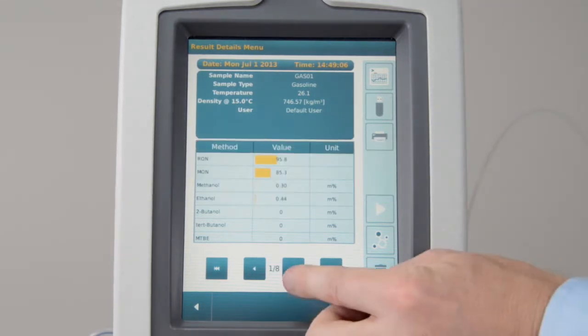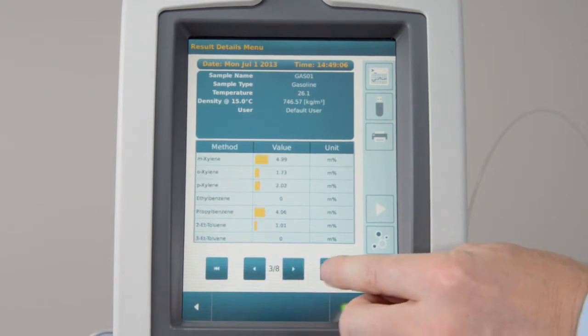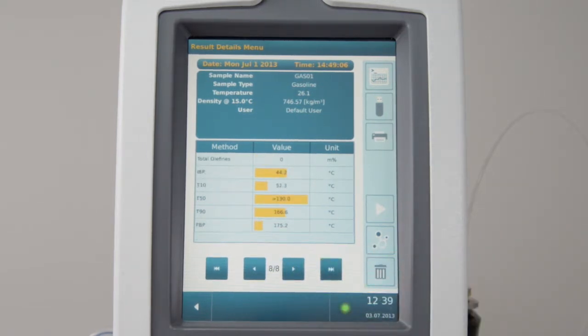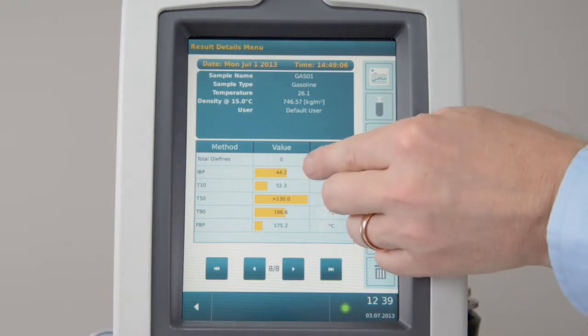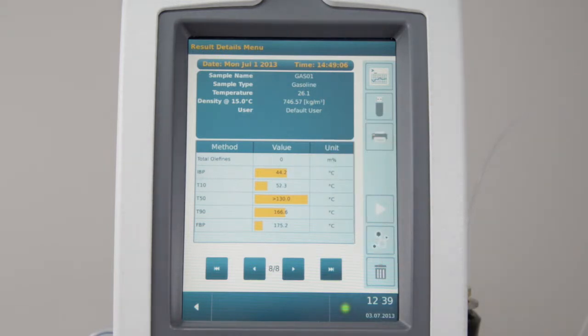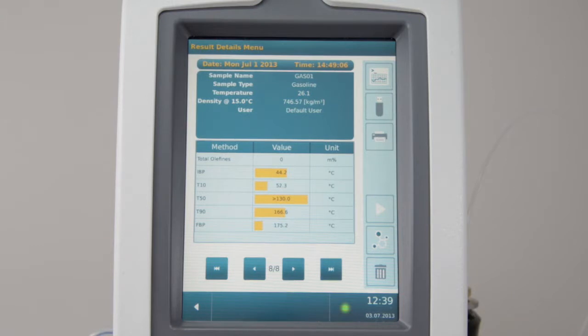Use the arrow buttons to flip through the results parameters. The yellow bar behind a result shows if your result is near the upper or lower limit of the testing range. If the values lower than or greater than are shown, the result is out of testing range.